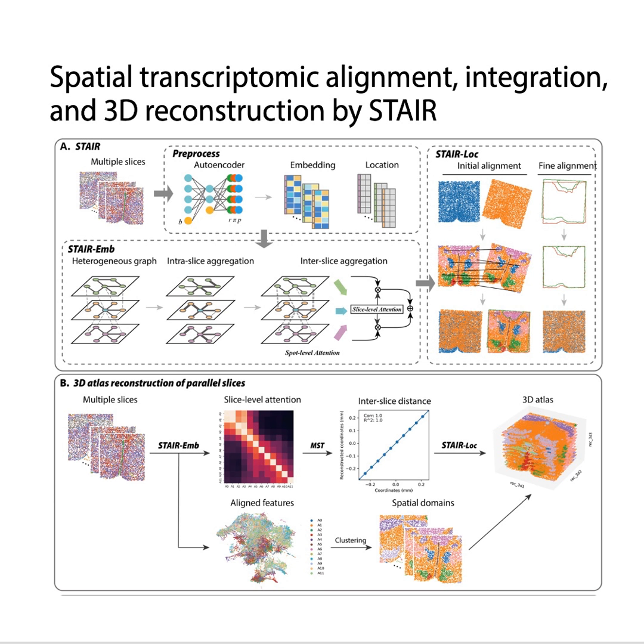This loss is compounded by technical difficulties. You're dealing with molecular data, and every single one of those slices is processed and sequenced independently. Right, in its own little batch. Which creates these systematic technical variations, what we call batch effects, in the gene expression profiles. So even if two adjacent slices were biologically identical, they end up looking slightly different just because of the lab work. So you end up with a pile of beautiful, high-resolution, but totally flat maps that are noisy and don't know where they belong vertically. A beautiful, noisy, disorganized pile of maps.